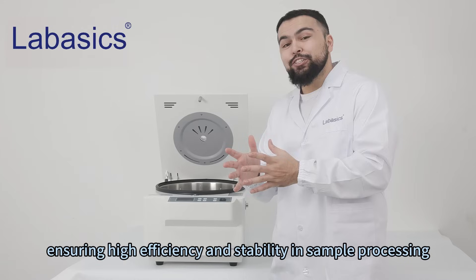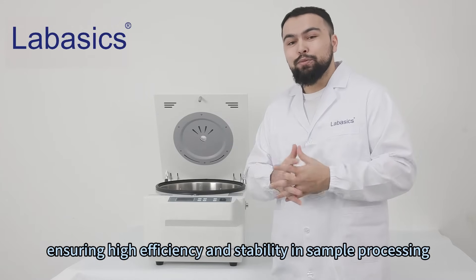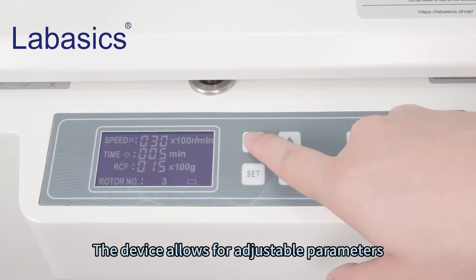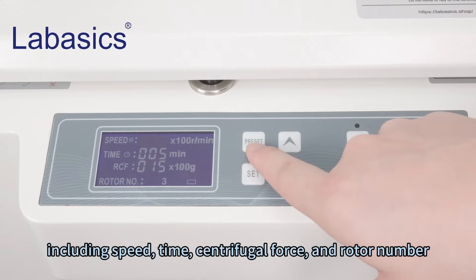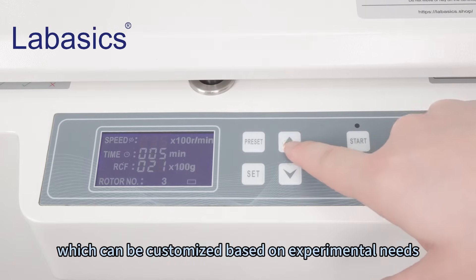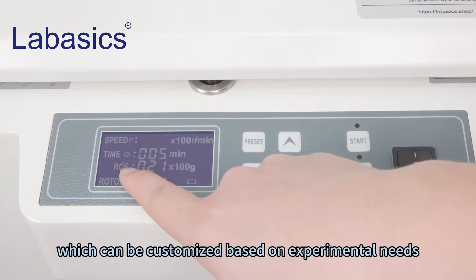The device allows for adjustable parameters including speed, time, centrifugal force, and rotor number, which can be customized based on experimental needs, ensuring high efficiency, stability, and simple processing.